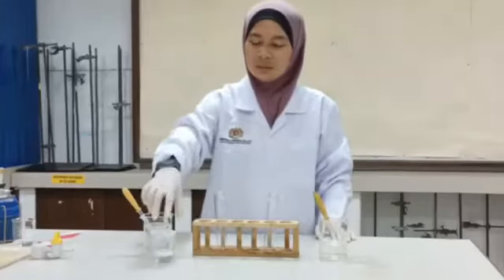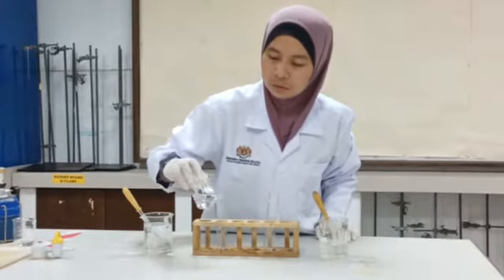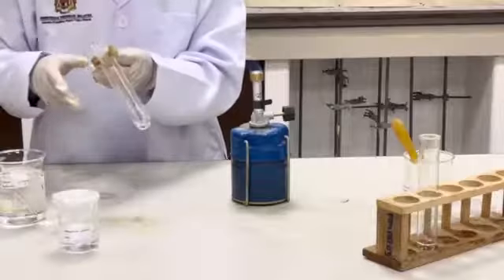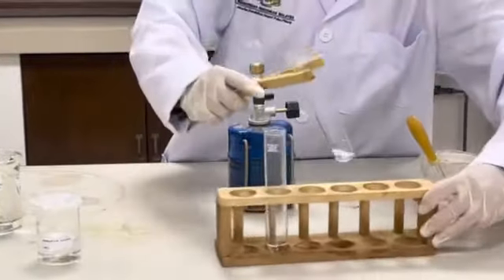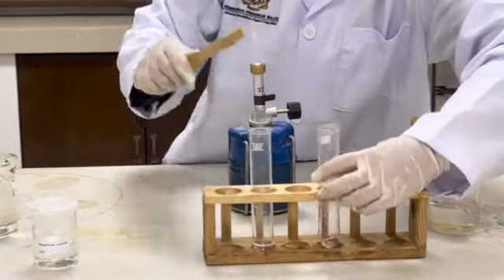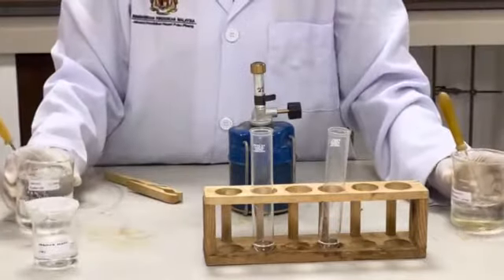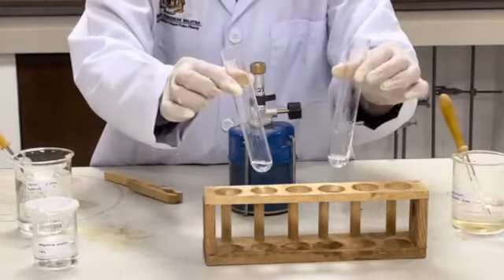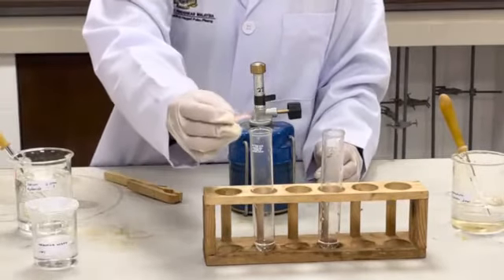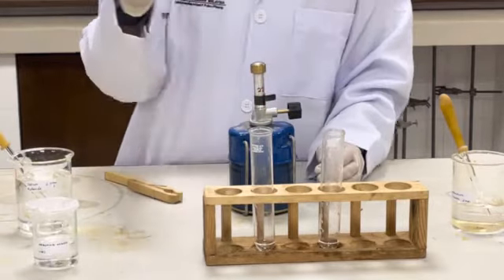Now we do the test for the cation in ammonium nitrate solution. We have 2 cm³ of ammonium. For ammonium nitrate, when you test with sodium hydroxide and ammonia solution, you will get no visible changes. So we need to heat it up and test with moist red litmus paper, and the red litmus paper changes to blue.